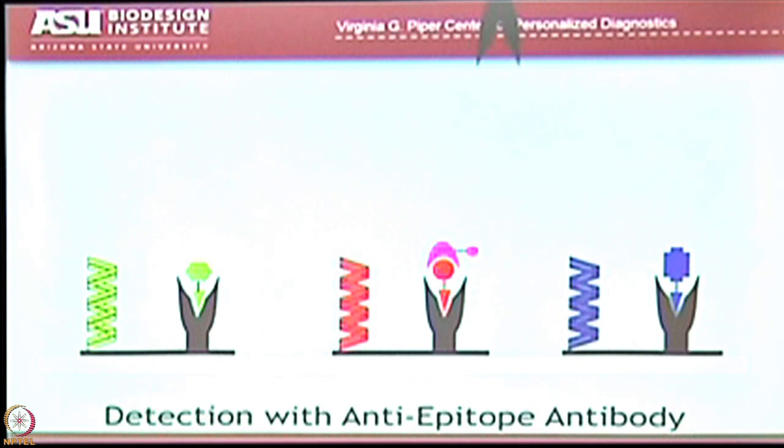Right? And I can detect that interaction with an antibody that has a fluorescent marker on it that will recognize either a tag on the pink protein or the pink protein itself. Now, there are all kinds of variations you can do here. You could use click chemistry to look at interactions, and we've done that. You can have other molecules that interact with this, avidin and biotin, lots of different strategies. But the bottom line is, as long as you can recognize the query protein, you can determine where the binding occurred.